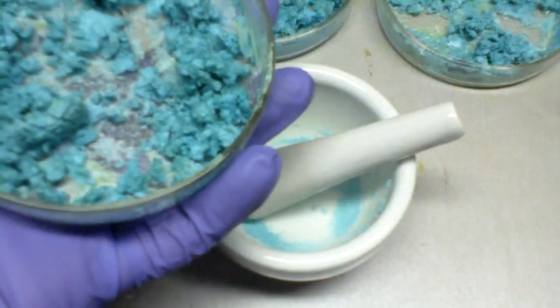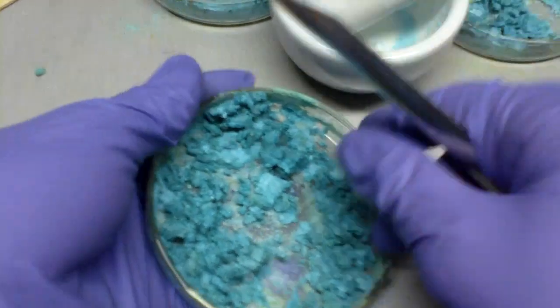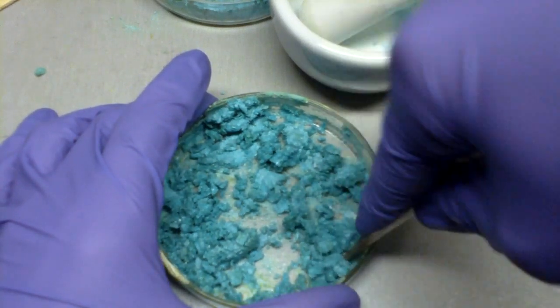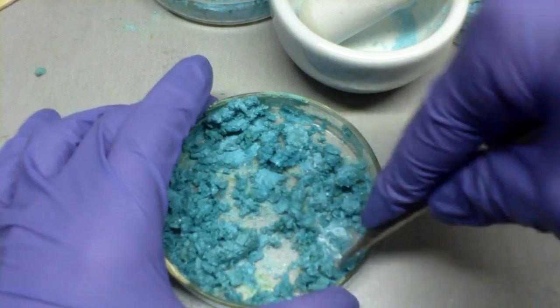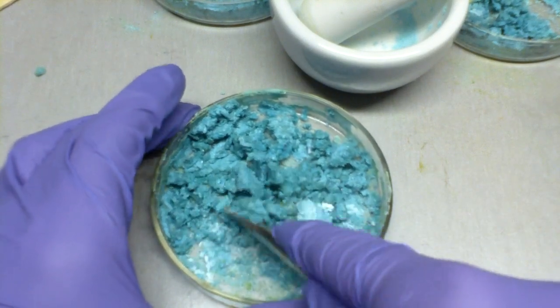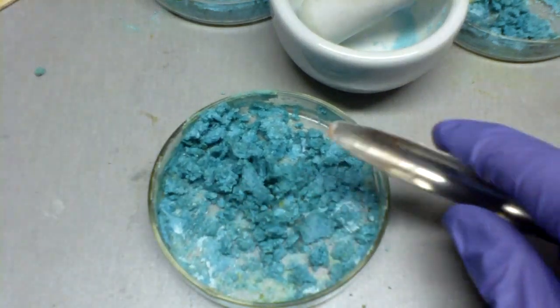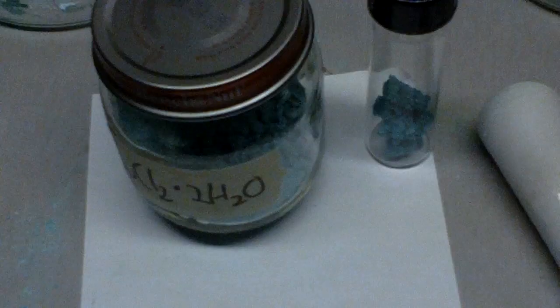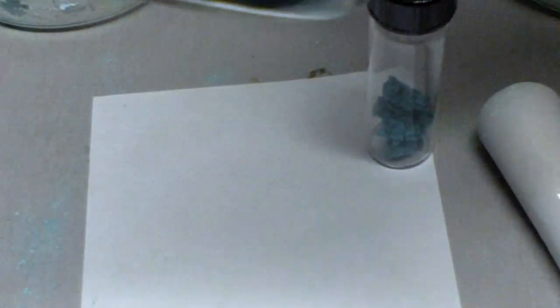Now, all that has to be done is the copper chloride needs to be scraped from the petri dishes and ground up for storage. So I am going to do all of that and skip over it and show you the jar with the crystals in it. Now, this is our final product of copper(II) chloride.